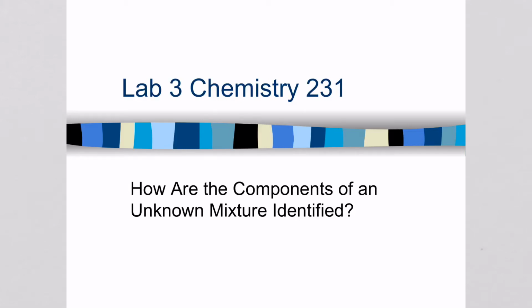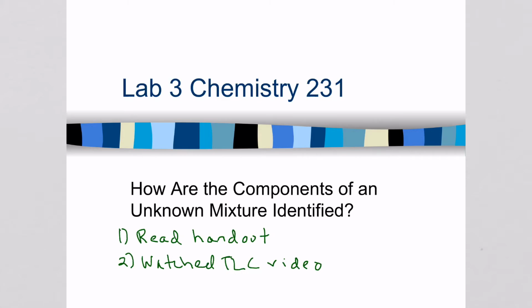This is the pre-lab video for Lab 3. How are the components of an unknown mixture identified? Before watching this video, you should have read the handout posted in Canvas for this lab and watched the TLC video.